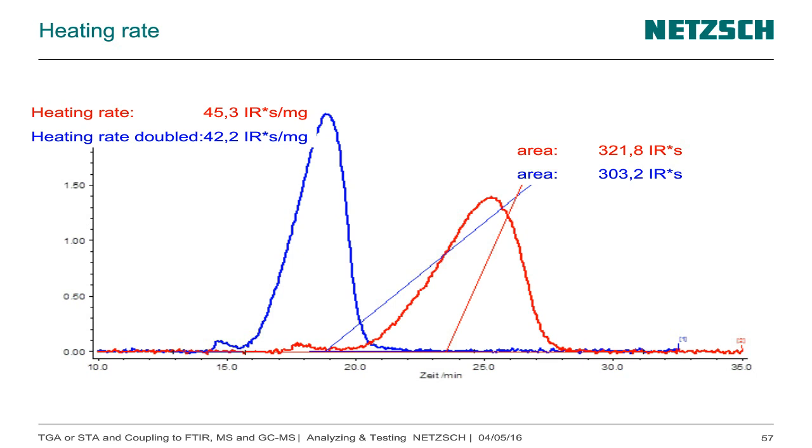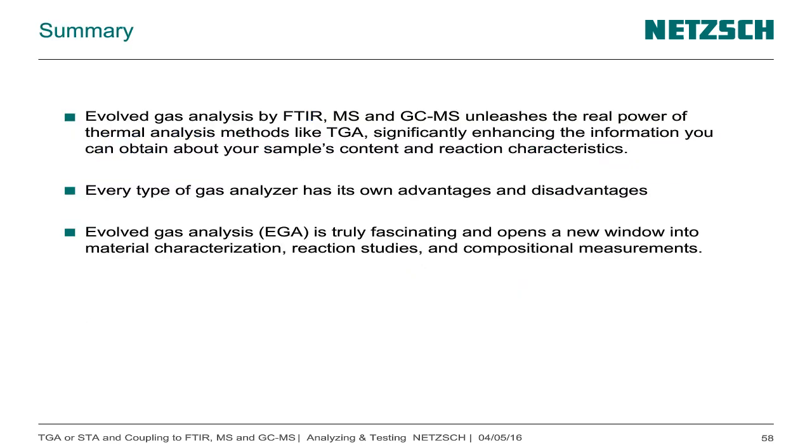So that's where I'm at the end of my talk. As a summary, I hoped that I could have shown you the unleashed power of gas analytic methods in combination with thermal analyzers.